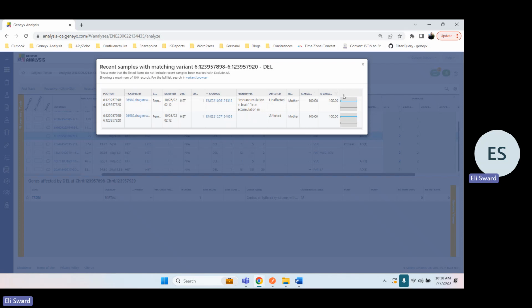And now we have these essentially 3 new columns. One is the percent analysis variant overlap. So that's saying this particular event is the event in your sample. So gray is your event in your sample of interest, and blue is the event observed in the other sample. And so what this does is it breaks down into percentages. So basically, if you have a full overlap of your event with basically your event of your other samples, you'll get a value of 100% or less, depending on the overlap there. Alternatively, if you were to take your particular event and create a percentage of overlap compared to the event in your sample, this would be the percentage, so percent variant overlap.